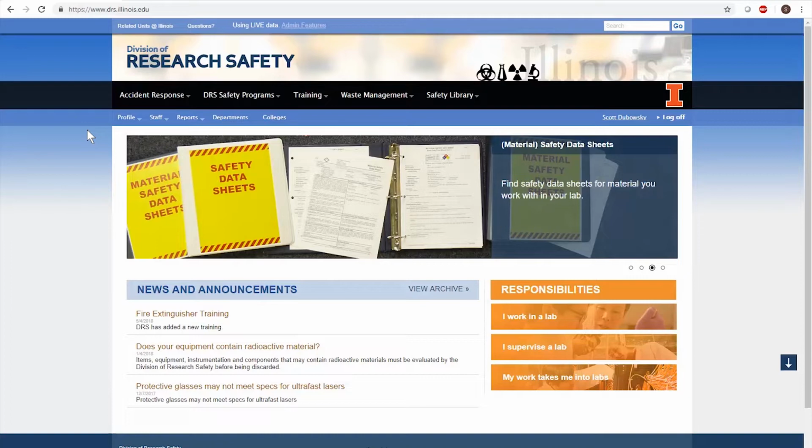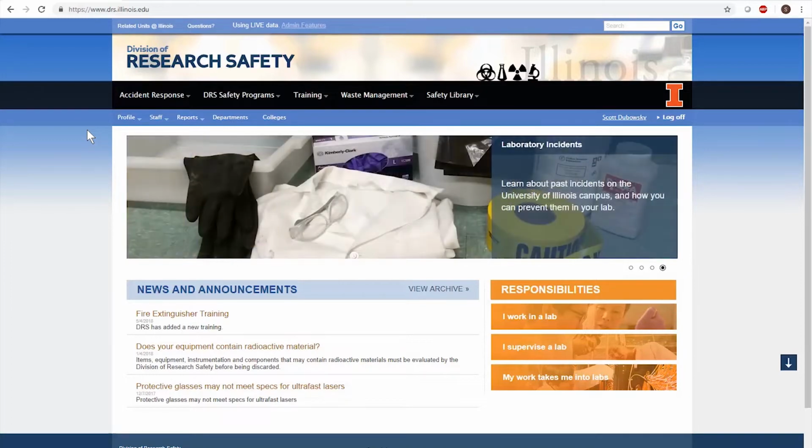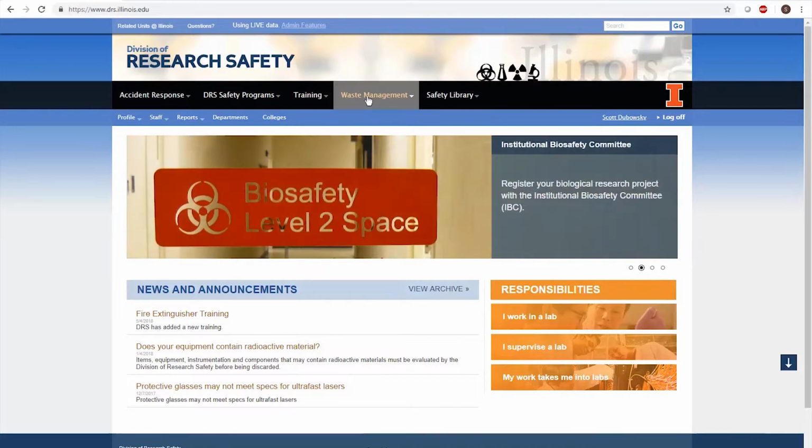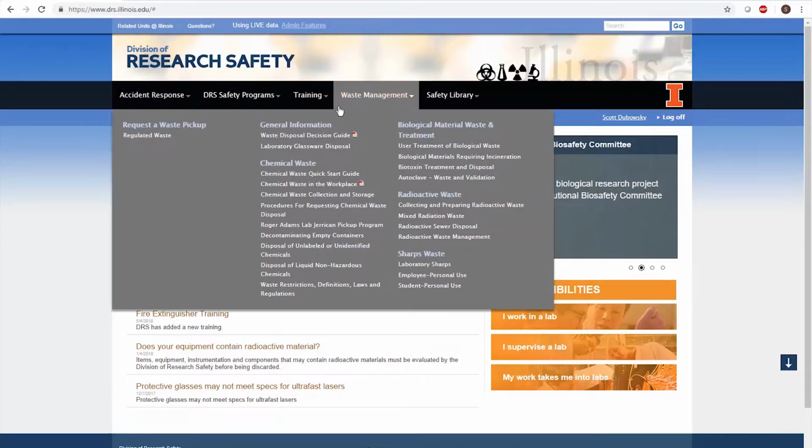The purpose of this video is to provide instructions for requesting a hazardous waste pickup through DRS. First, go to the DRS website, which is found at drs.illinois.edu. Then, click on the Waste Management drop-down menu. There are several guides and sets of instructions regarding waste contained in this menu. Refer to these links first with any questions you may have.